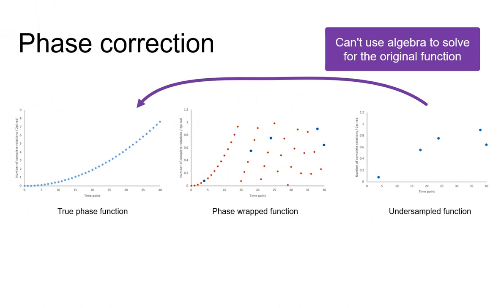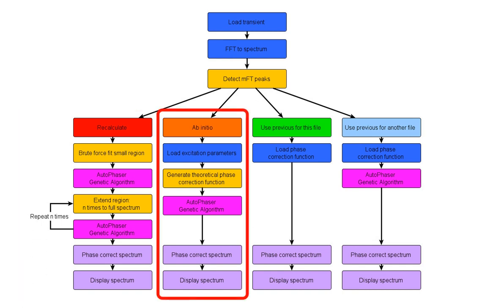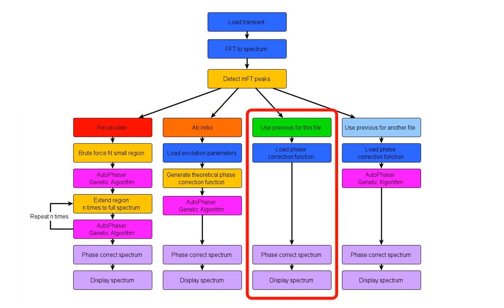In the Autovectus package there are four different methods provided to produce an absorption mode spectrum, and in this video we'll go through each one of them in turn. This flow diagram shows the four possible routes.